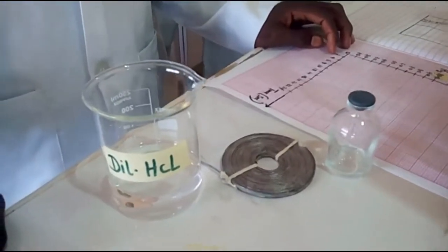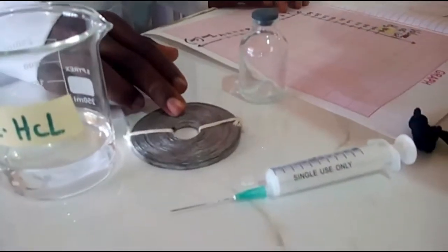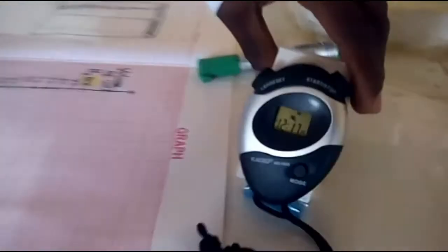The materials needed for this experiment are dilute hydrochloric acid, magnesium ribbon, reacting vessel, syringe, stopwatch, graph sheet, and our writing materials.